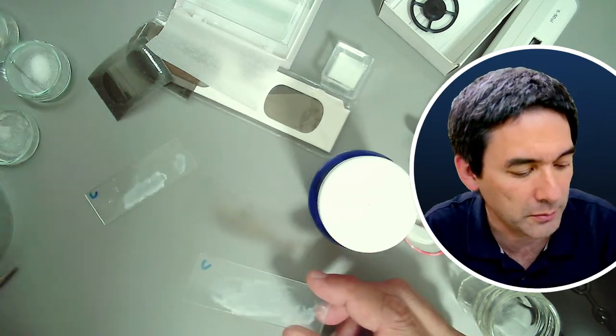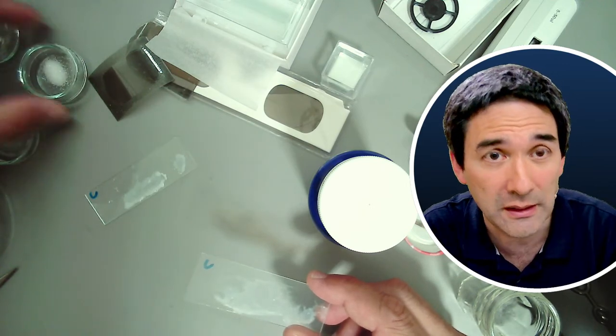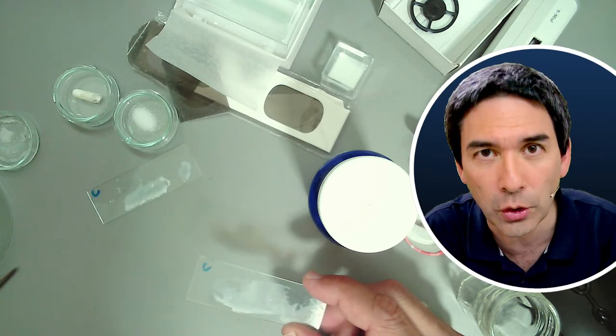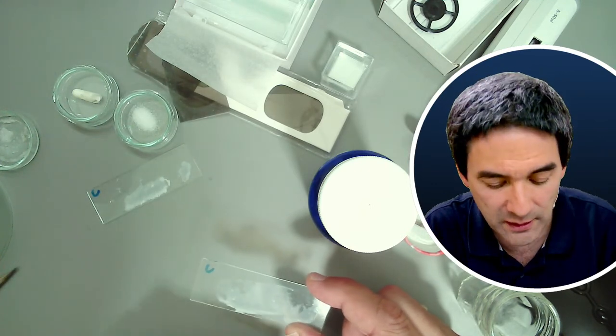But later on, I will be putting some aspirin and some caffeine also under the microscope using some alcohol, and then this dries much faster.